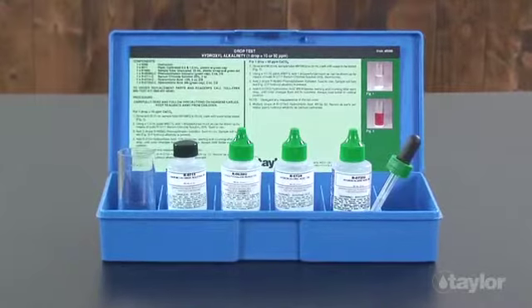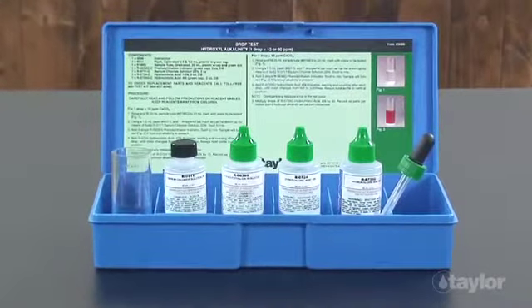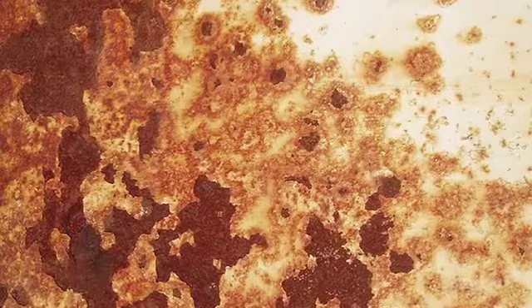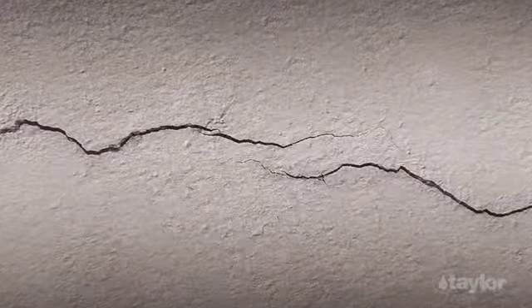All boilers must contain a certain amount of OH alkalinity in order to inhibit corrosion and to aid scale conditioning agents in protecting against scale and sludge deposits. When levels become too high, foaming, corrosion, and caustic metal embrittlement can occur within a system.